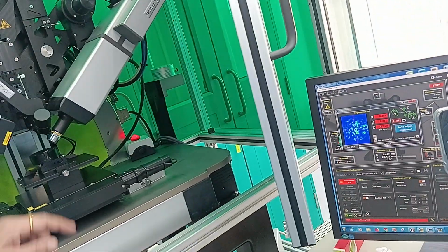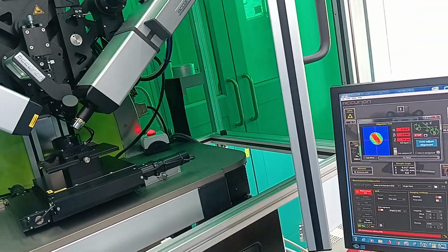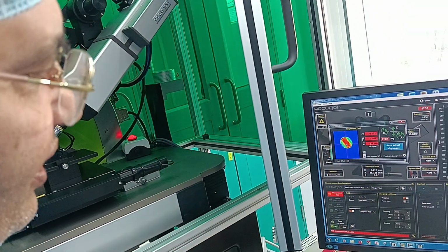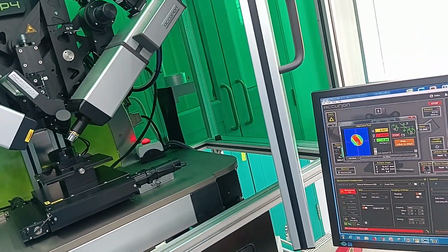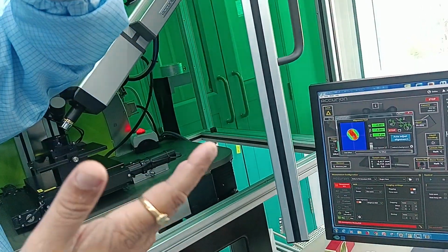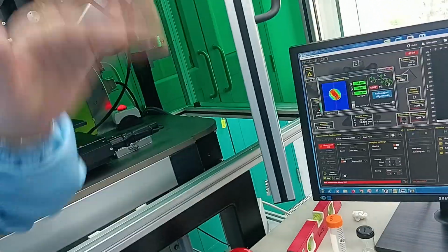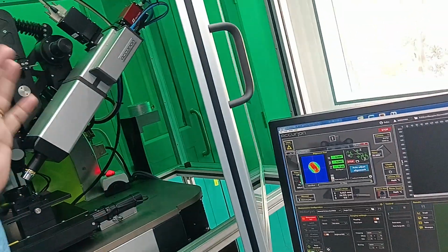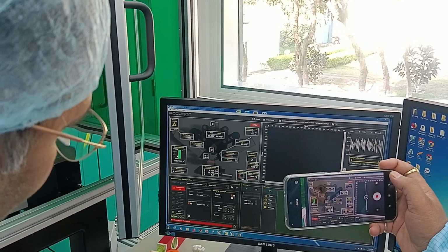Now, it is not right. Then I have to put it on the sample. So that becomes very nice. So I just say auto adjust. So it will automatically align, and this means my sample is perpendicular to the plane of light. Then only I'll get good measurements. Anytime you come, open it.